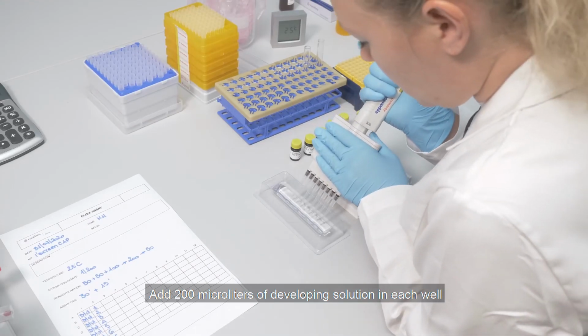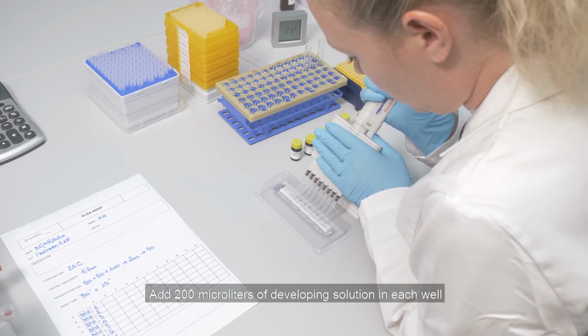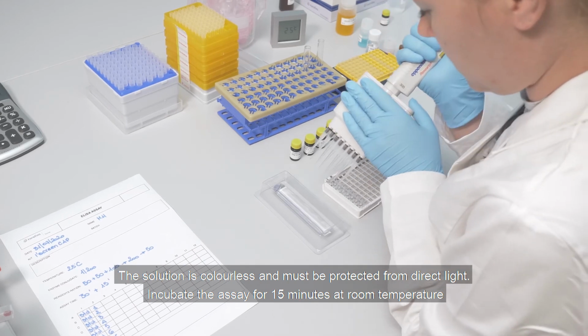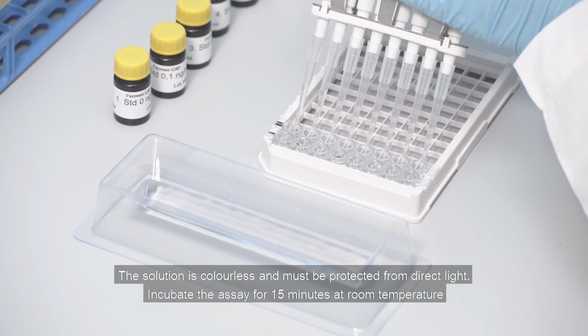Add 200 microliters of developing solution in each well. The solution is colorless and must be protected from direct light. Incubate the assay for 15 minutes at room temperature.